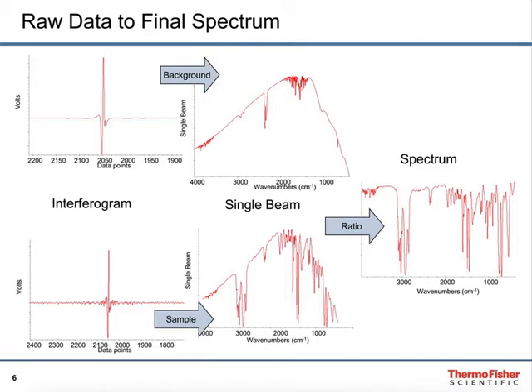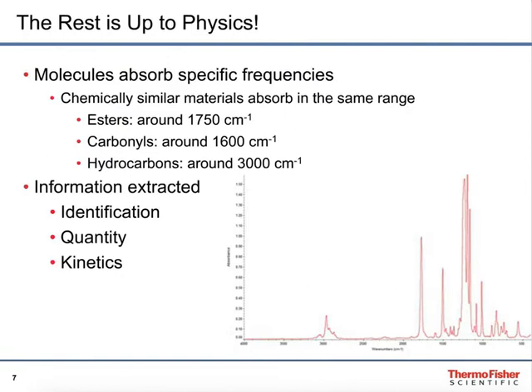You won't even see them. You don't need to see them. The only result that you really need is just the final spectrum, and that most of the time is what will be presented. And the rest is up to the physics.